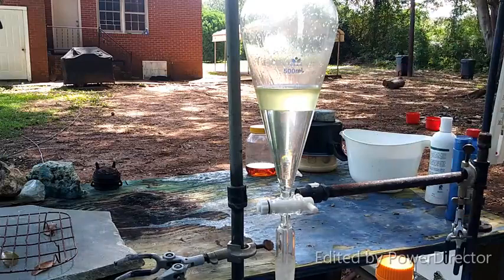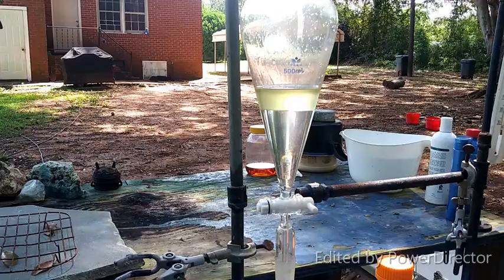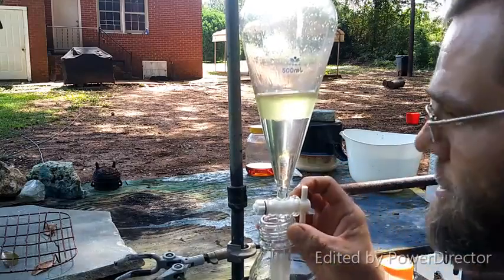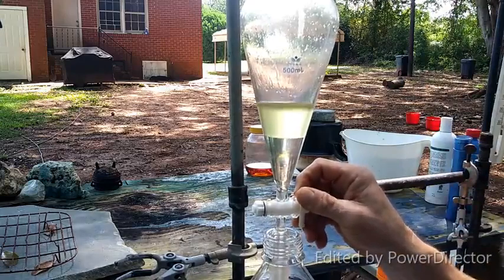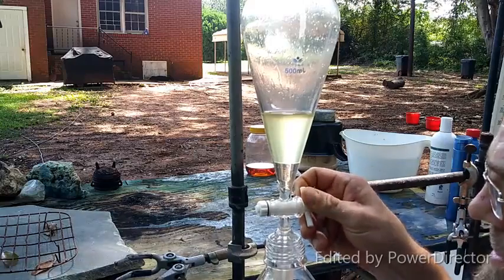There will be some chloroiodomethane that will come off first, and then we should be left with pure diiodomethane. Okay, go ahead and remove our water layer here, along with that bit of whatever that is there.